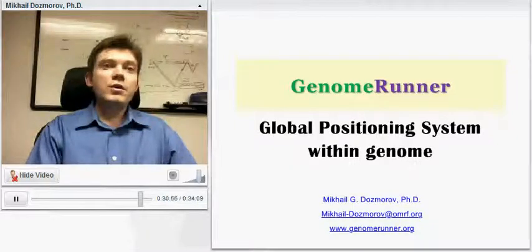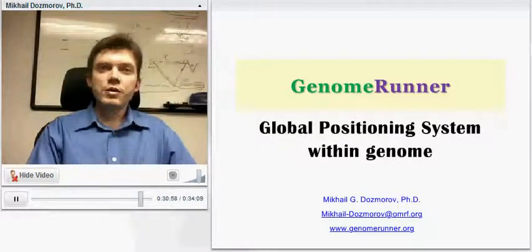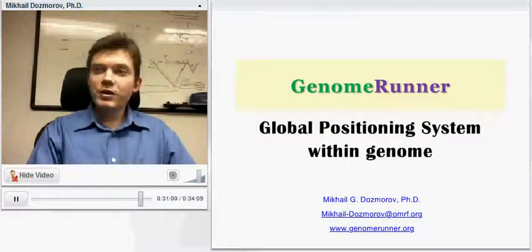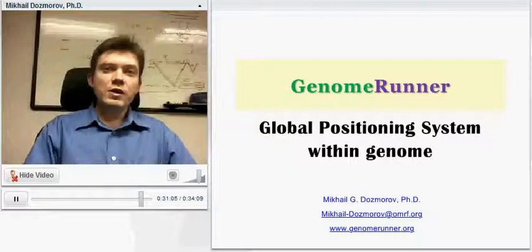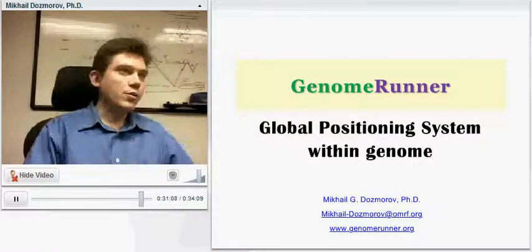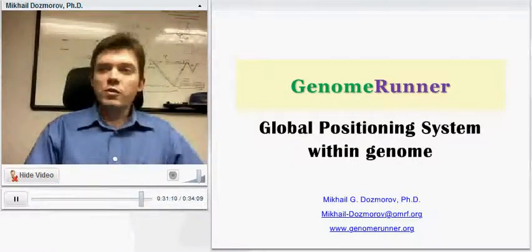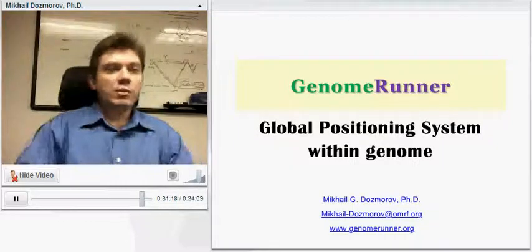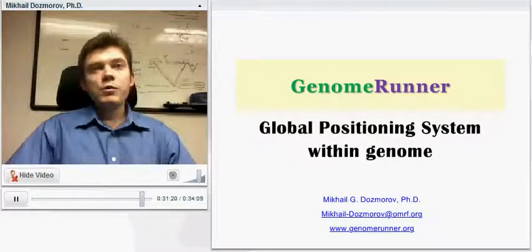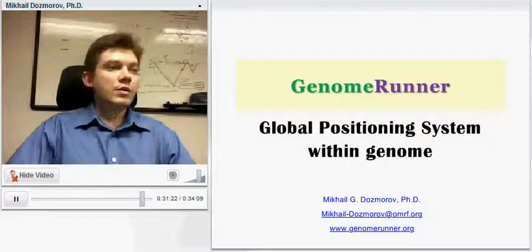Let me just add that the Genome Runner project is an ongoing project. It's currently still under development. Right now, if you go to the website, you can download it for the human genome, but in about a week or a couple of weeks, a version will be available that will work with the mouse genome as well.